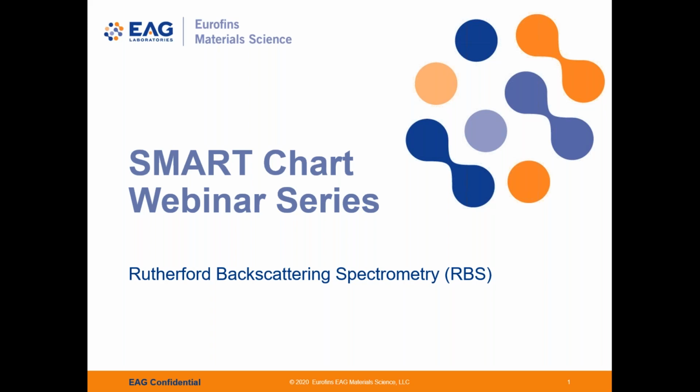Welcome to the Smart Chart webinar series. Today, we'll be talking about RBS, or Rutherford Backscattering Spectrometry.